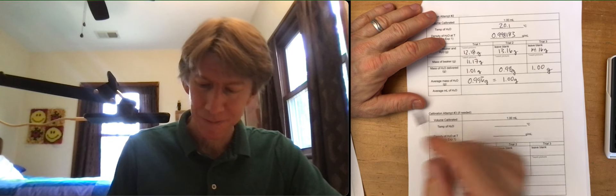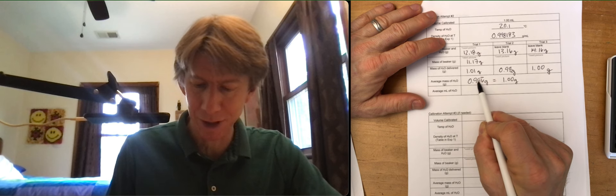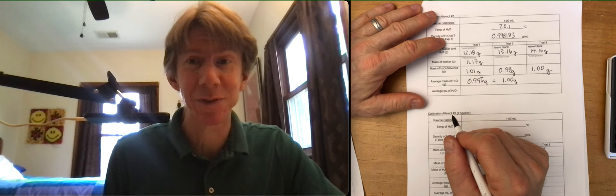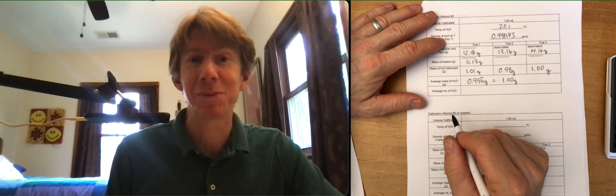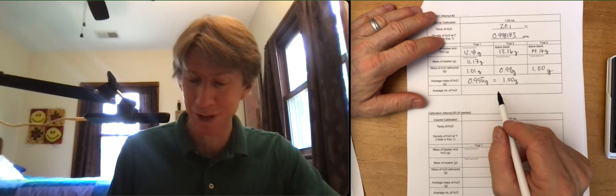So, 0.996 repeater should actually round to 1.00 grams. And that's because if you were to round this to a 0, it kicks it over to a 1, which is an interesting case where you have a number here with two sig figs, and you actually get three sig figs for your answer here. Pretty cool. I did not plan that, but that's awesome that that worked out that way, that you could see that.